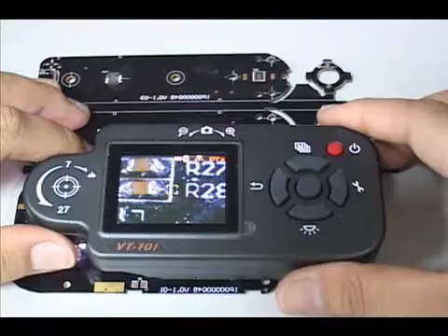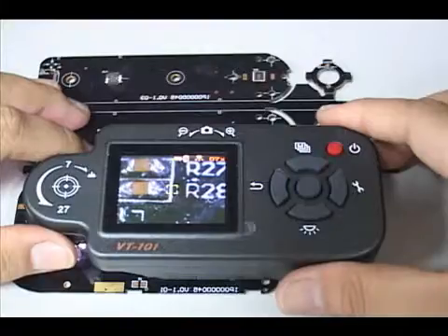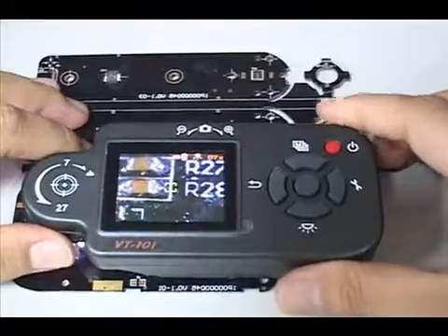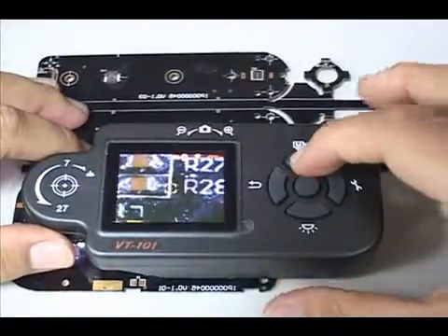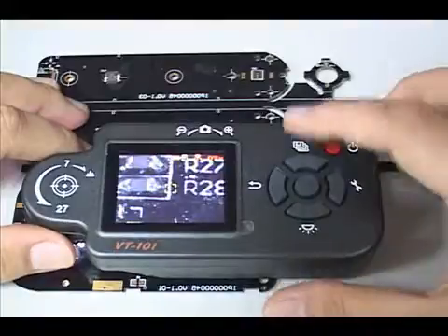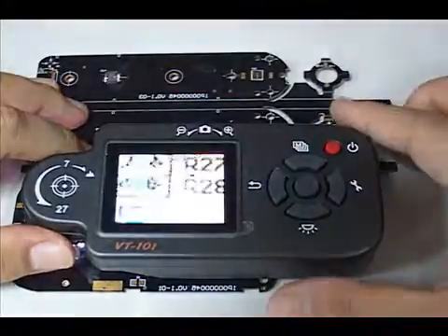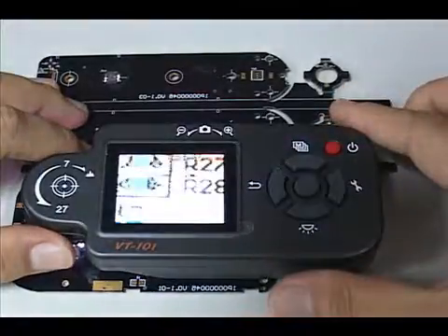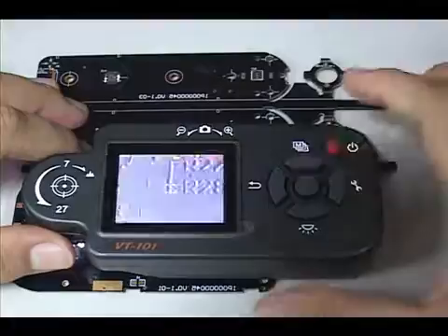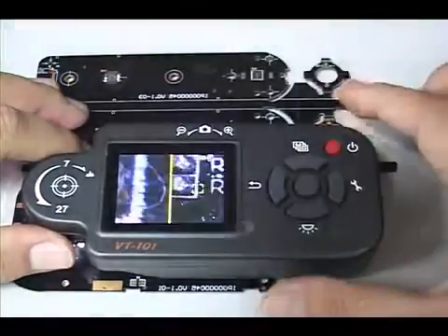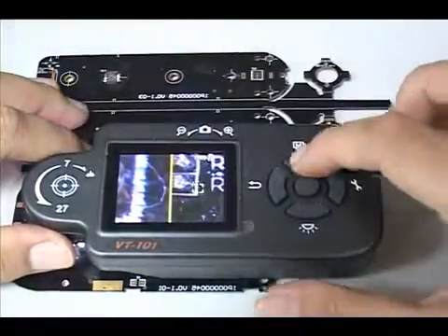In normal observation mode, press the top button to switch special effects, including normal, grayscale, inverse, max, and minimum.